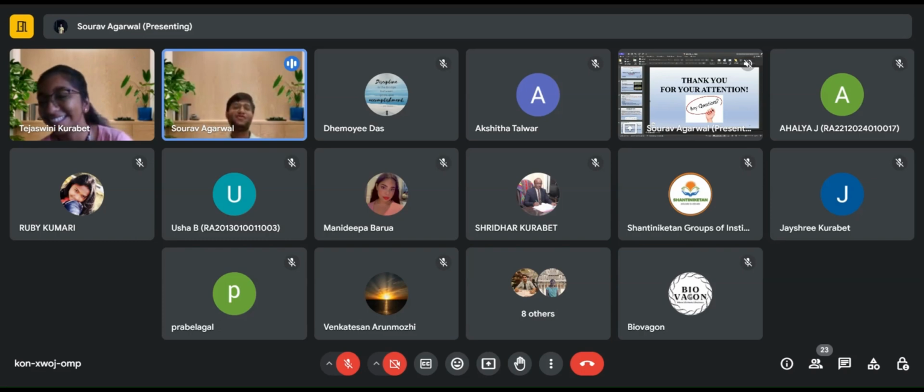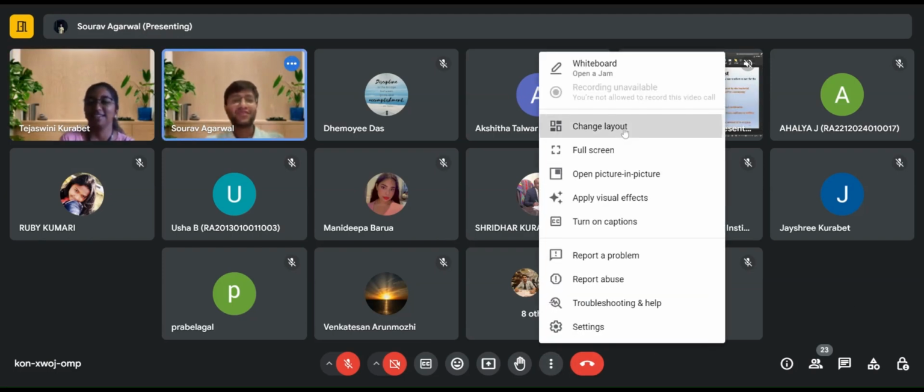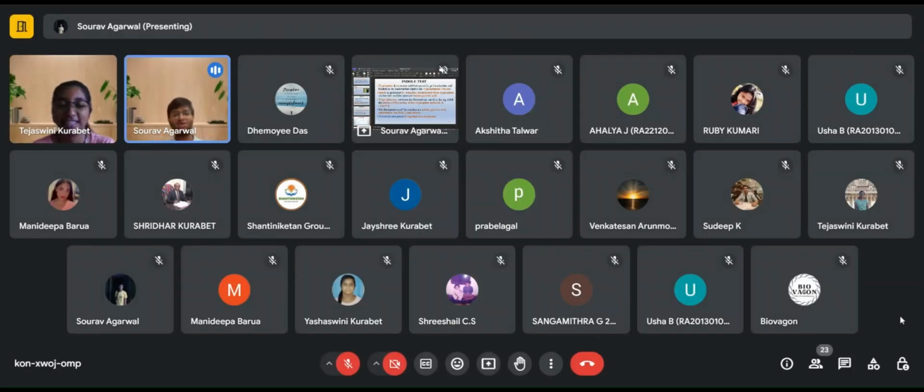Okay, can you tell me which test you found the most interesting? You can type it out, we'll read it. Okay, to recapitulate, we explained catalase, oxidase, coagulase, motility, using motility agar, and the use of TSI media for three different tests, H2S production, and of course the IMViC tests, which include Indole, Methyl red, Voges-Proskauer, and Citrate tests. So, which one was the most interesting?